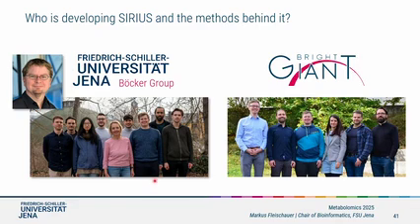Yeah, so who is doing that? SIRIUS is developed by two groups now. It's developed by the Böcker group from the University of Jena, and it's also developed by our spin-off company, Bright Giant. And they are basically doing all the work.